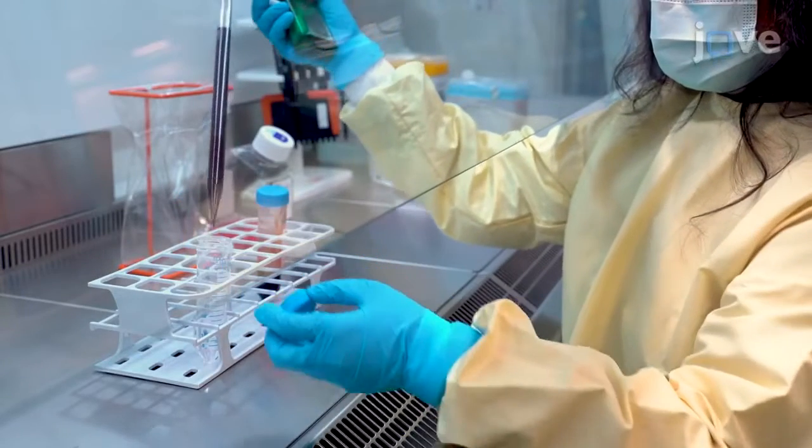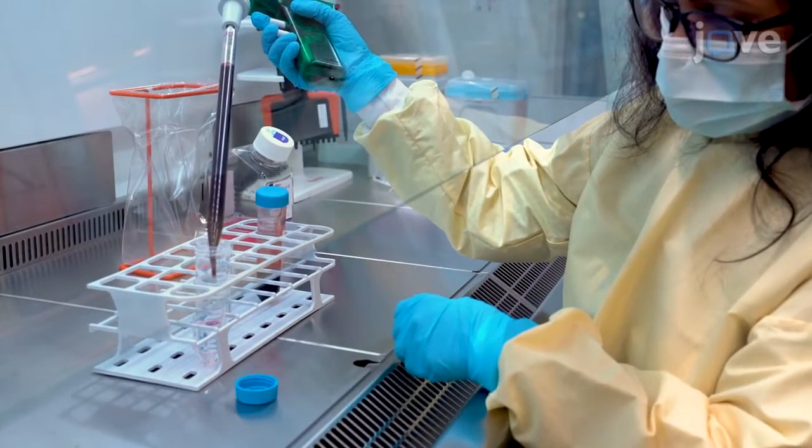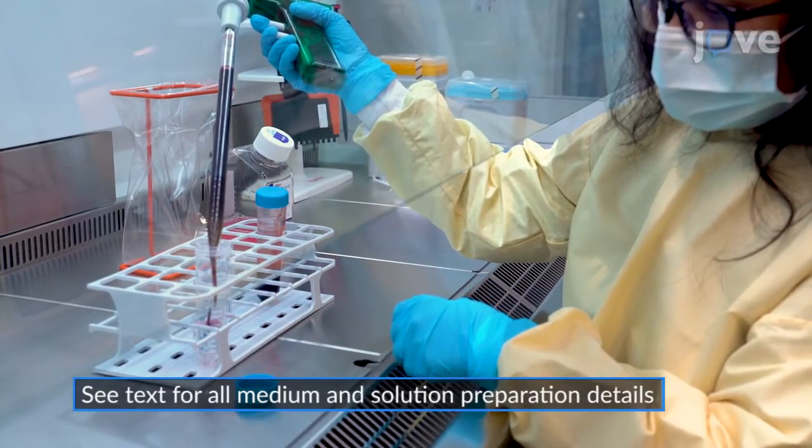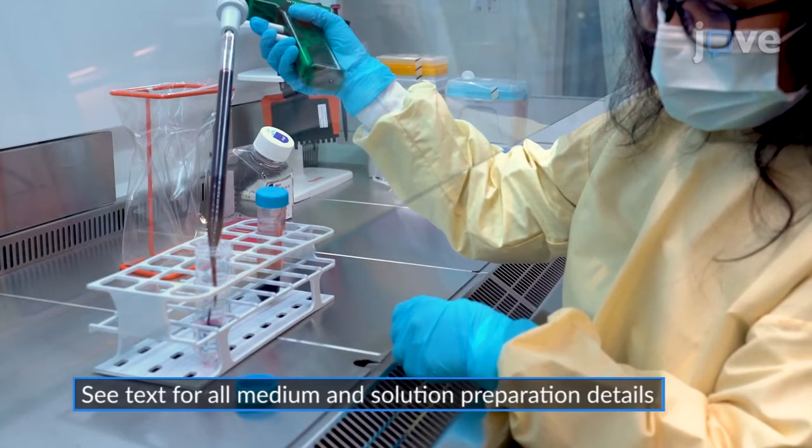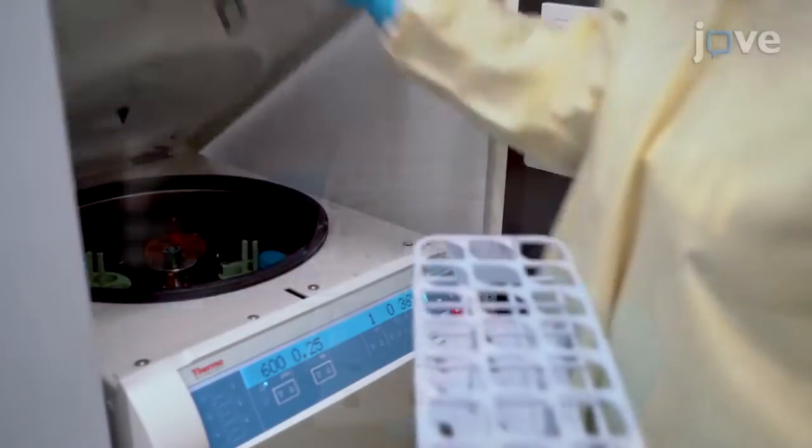To isolate PBMC from human donor Buffy coats, use a pipette to slowly overlay 15 milliliters of Buffy coat blood down the side of a 50 milliliter tube onto 15 milliliters of density gradient medium and separate the cells by centrifugation.